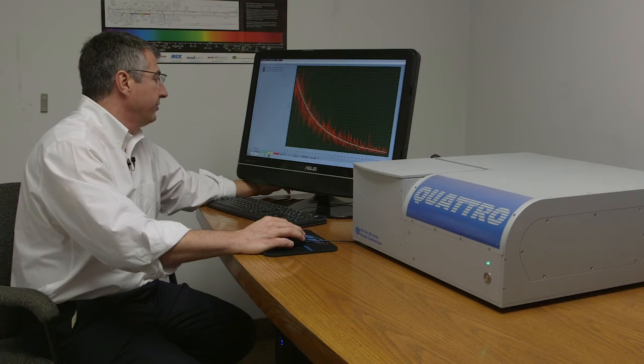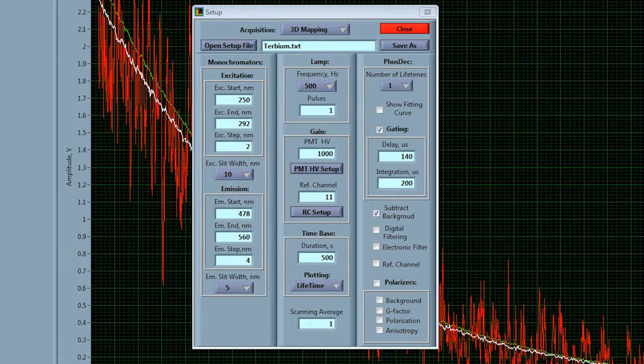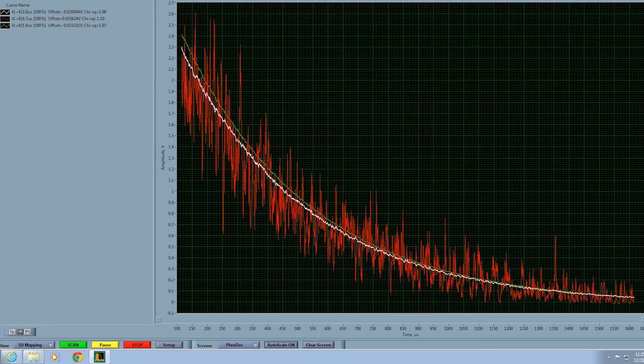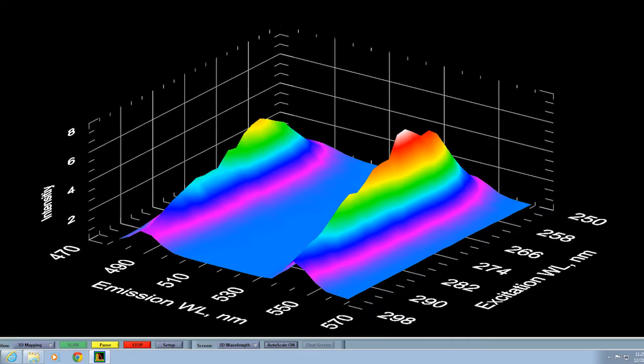In order to do that we simply go again to the setup panel, adjust the wavelength range across which we want to scan the excitation and the emission monochromators, make a few other adjustments to the detection parameters, and then go to the acquisition selection panel. We're going to do a 3D mapping this time and we're just going to hit scan.